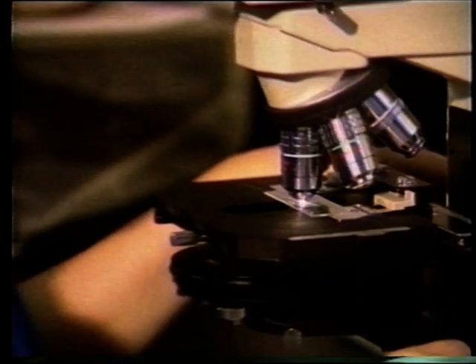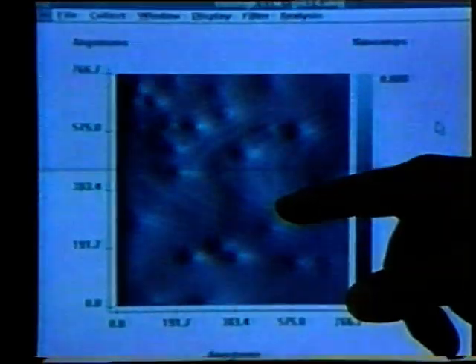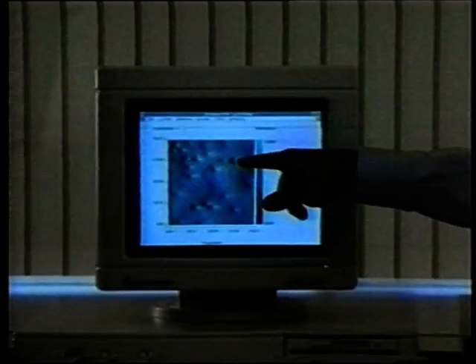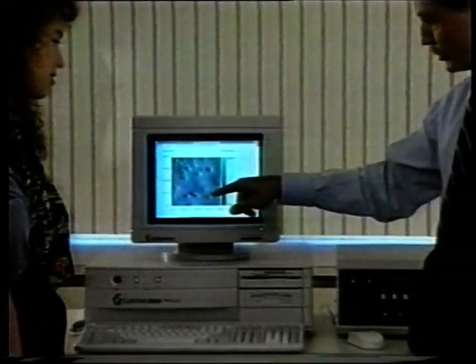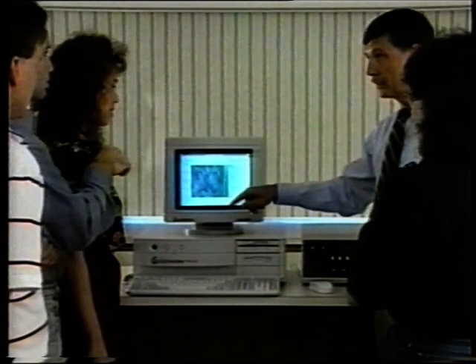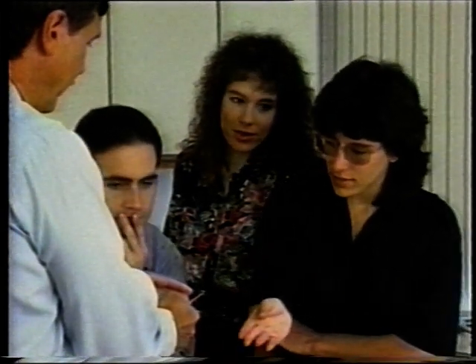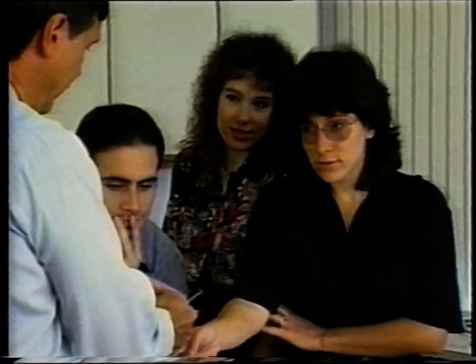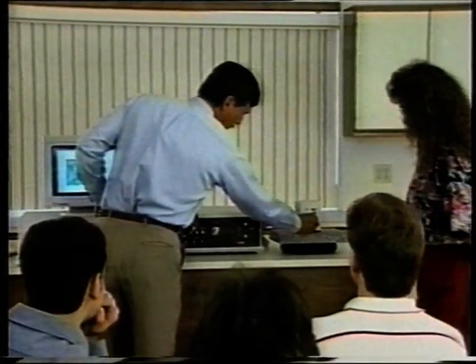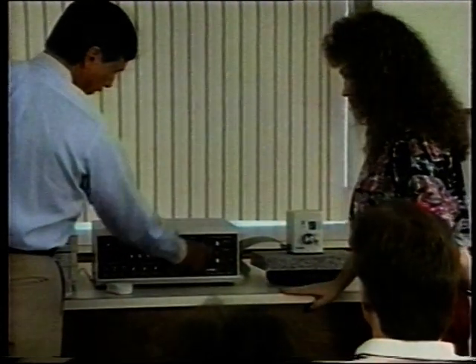As the optical microscope improved our ability to understand the form and structure of the world around us, the scanning tunneling microscope opens the atomic world for our inspection. In 1988, a scanning tunneling microscope was used as a teaching instrument at the University of Rochester, where instructors were able to more quickly convey difficult concepts involving atomic structure and quantum phenomena, such as electron tunneling.